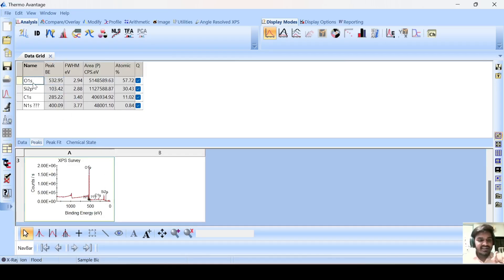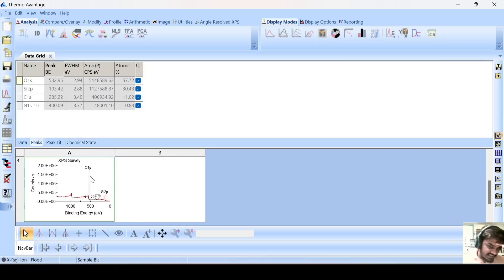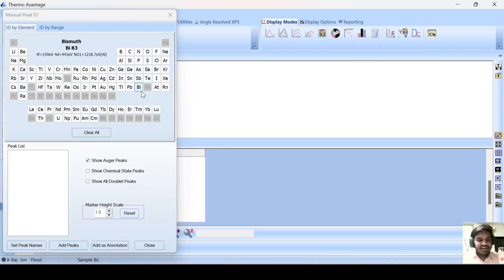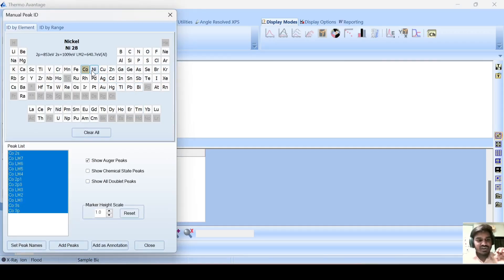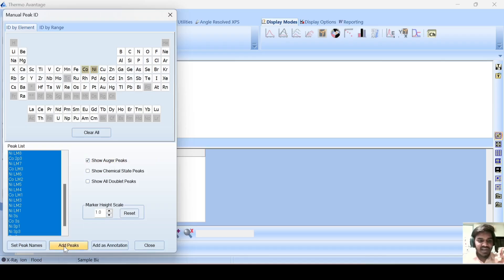This material has oxygen, carbon, silicon, and nitrogen. Suppose your material has a particular element concentration you know about, but it is not coming here. In that case, you have to again select this, go to this ID and simply click here. Suppose my catalyst has cobalt and nickel, but they are not coming in this table.